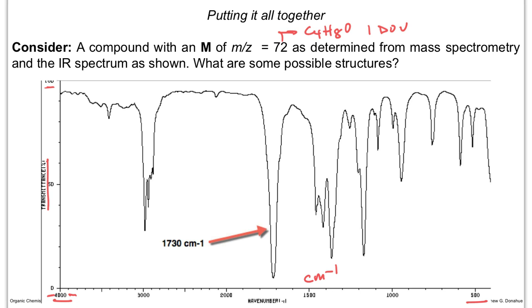So when you're reading these, at 100%, all of the light is going through the sample. There's nothing in the molecule that's absorbing any of that light, so you don't see any signal. So I'm going to say there's nothing being absorbed.